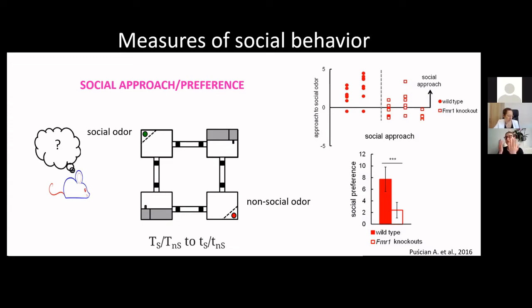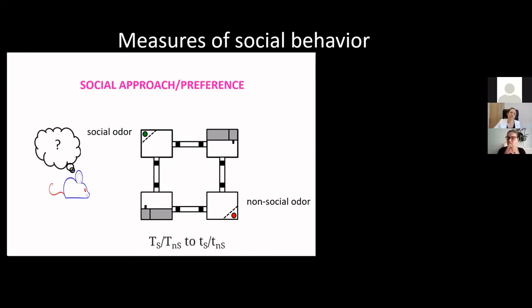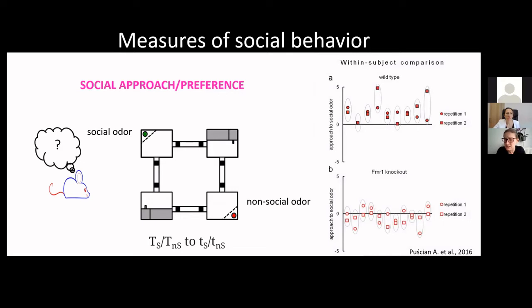In this case, we are comparing between the two groups, knockouts and wild types. But we can also do within subject comparisons, if you would be interested in that. When we first produced Eco-HAB, we did a series of experiments where we had two Eco-HABs placed in two different laboratories, and we tested the same groups of mice twice in terms of approach to social odor. So you can see the data from two repetitions from both knockouts and wild types, but this is less important, on the same axis. So this is animal number one, two, and so forth. And as you can see, I think it's a remarkable reproducibility here. I think we got really lucky with this result, to be honest, because it seems like it's very, very coherent.